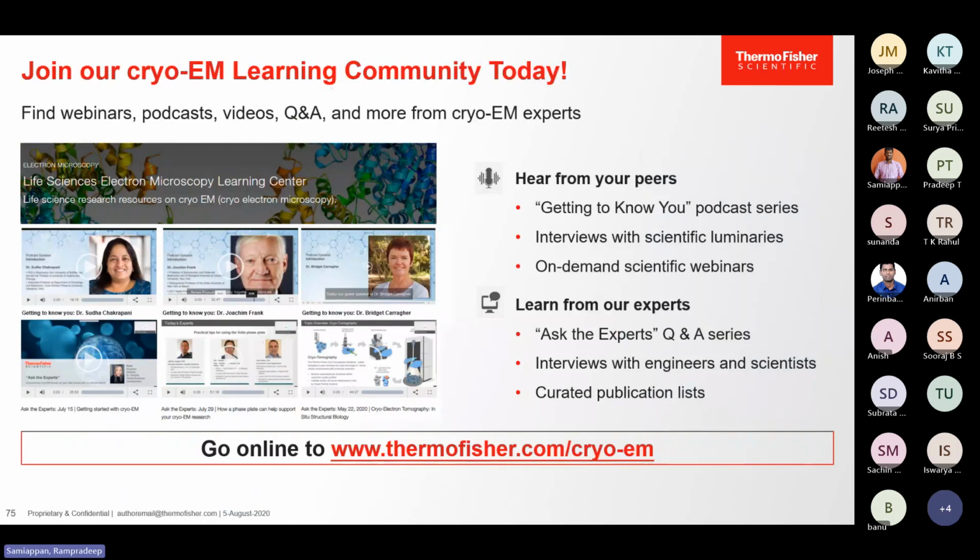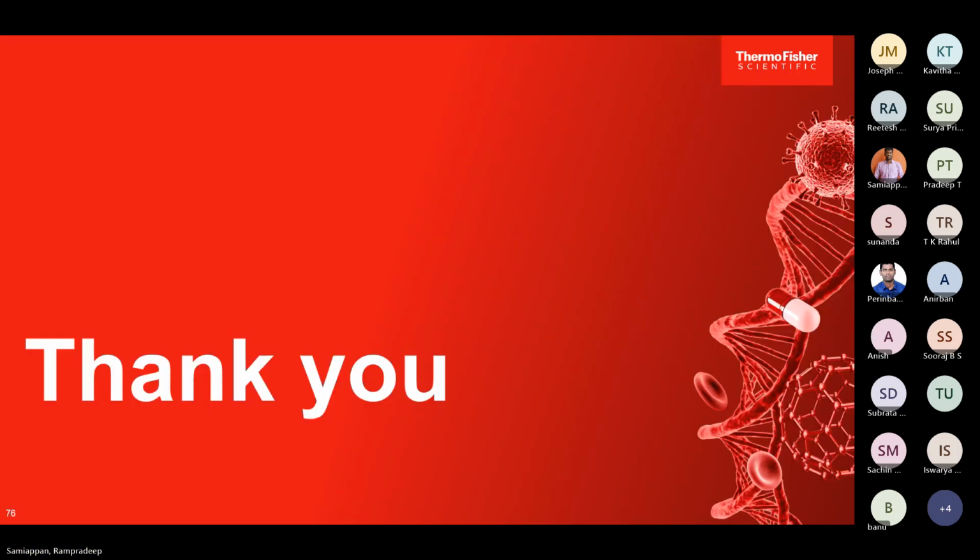With this, I would like to conclude my presentation, and I hope you received a few insights regarding negative stain EM as a technique, cryo-electron microscopy as a technique with different particle types, and later a few insights into cryo-electron tomography. I would like to touch upon microED, but I will take that in the next session. Thanks a lot for listening to my presentation, and I again sincerely apologize for the technical glitch that we faced initially. Thank you.